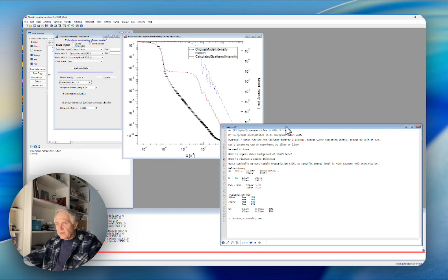It's very stable, it's very reliable, and at the same time provides you with much thicker samples than you get through at lower energies like 10 or 12 kiloelectron volts. So you benefit a lot more from the sample thickness, until you get down to like 30% transmission or below, then the sample thickness kills you.